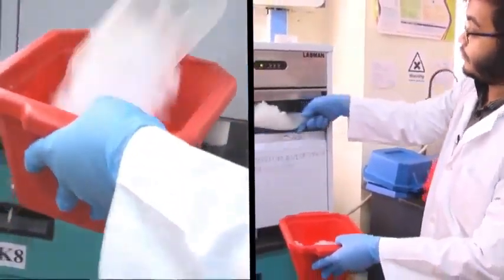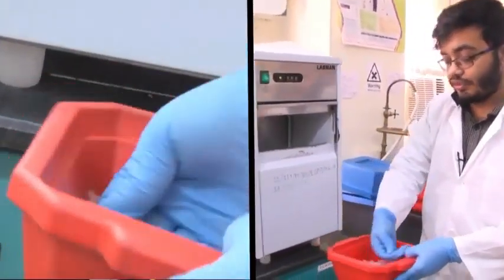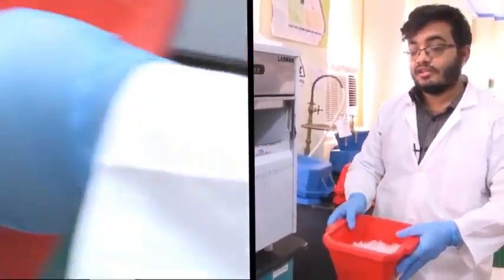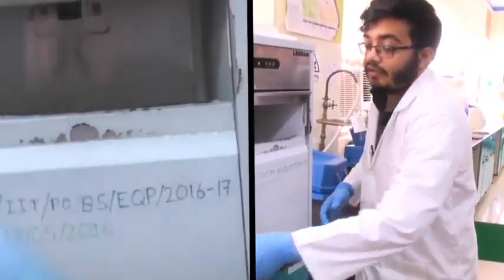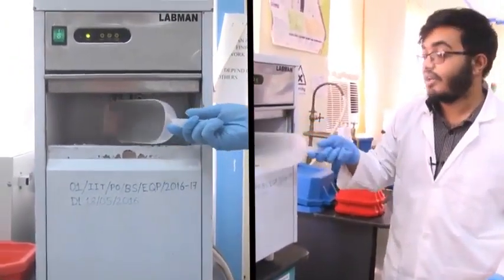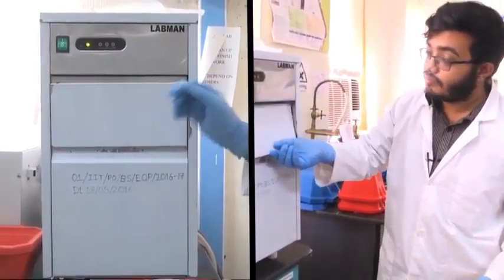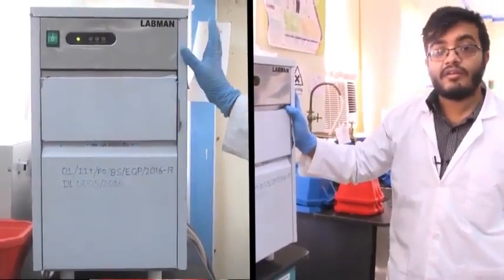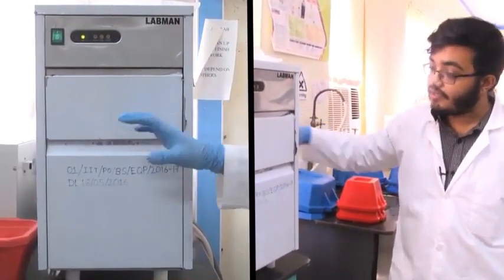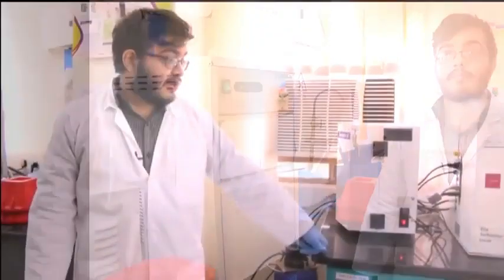This is a very underappreciated but very essential component of the laboratory, because if you don't have ice cold conditions, many reactions will not work, and making ice cubes in normal refrigerators is laborious and time consuming and does not really suit the purpose. So often it's quite essential to have ice flake machines which will take water supply directly from the tap, and convert it into flaked ice which you can then just take out and use.